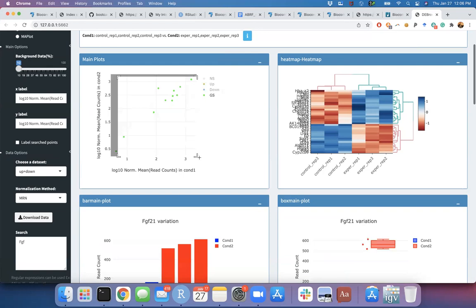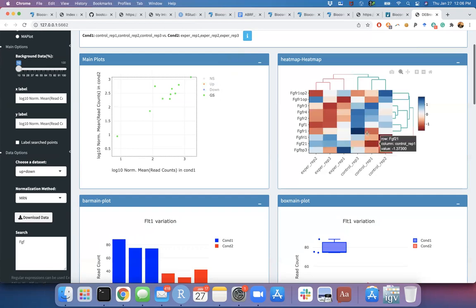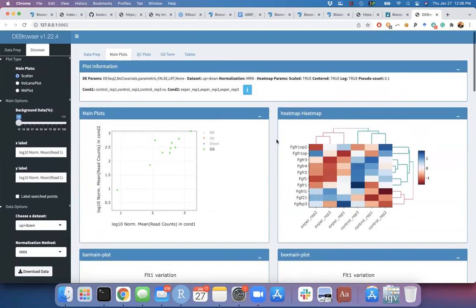And when I select them with this box select, those are the heat map that you're looking for. Then when you hover, you can see everything here, or when you click on there too. So this is what we wanted to do. Usually you discover your genes using these tools, but I'm going to show you next Tuesday a little bit, like half an hour.